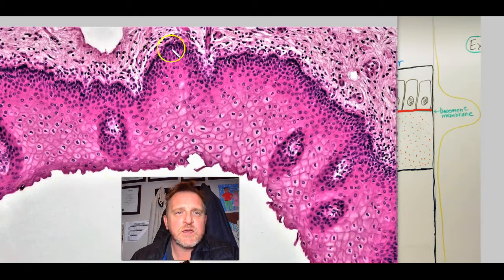And here's what I was mentioning, it looks like a little nucleus. It is the nucleus, in fact. It's the yolk of my egg analogy. And then the pink cytoplasm, which is staining with the eosin, if you're in the know, that would be the white of the egg. So all of these are squamous cells. It's actually a cross section, so you're looking at it side on, and then you can see the connective tissue here at the bottom. I'll just highlight that with a yellow double arrow. And so our basement membrane would be running along here, just to remind you.